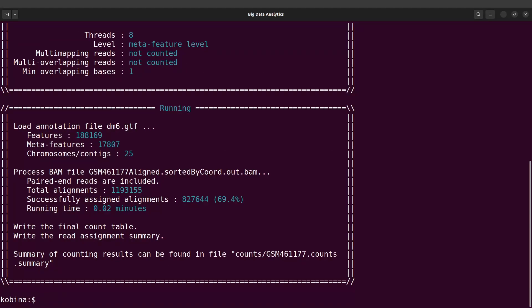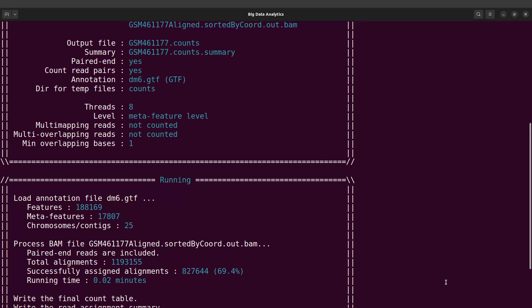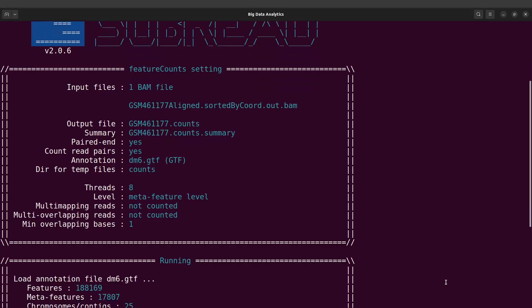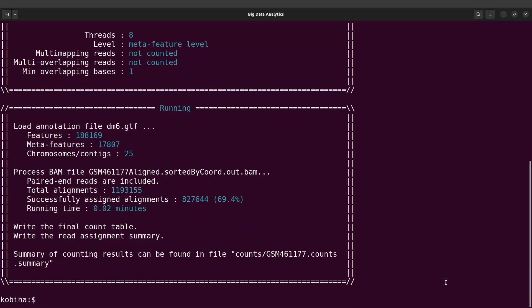It's currently working — this is fast. featureCounts has done its work. Depending on your computing power, it may take some time, but this one was very quick. So we have the information we need here. Let's proceed.